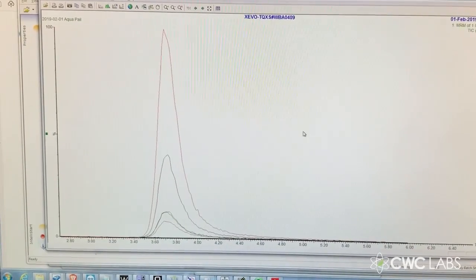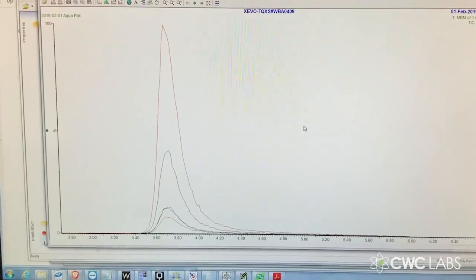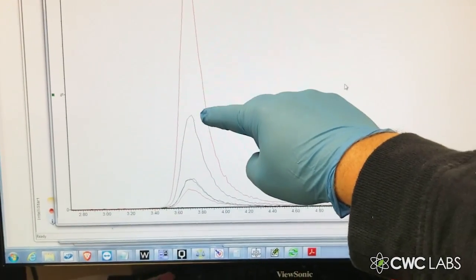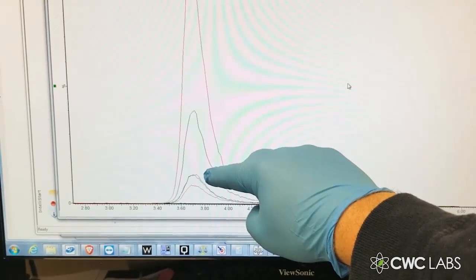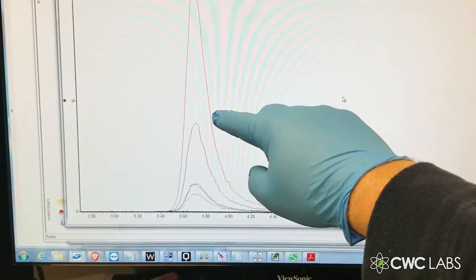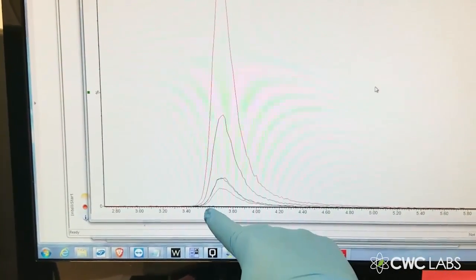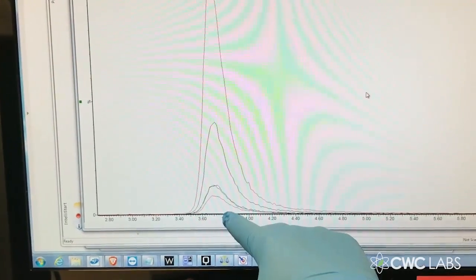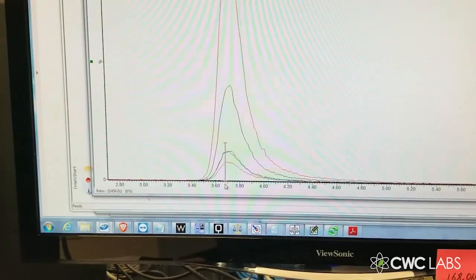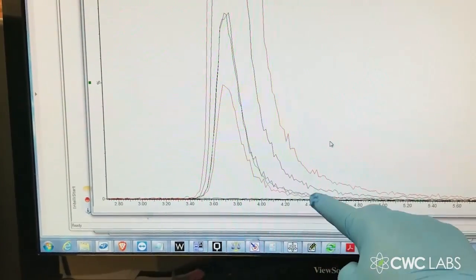Finally, here are the results for the large filters. And by the way, I'm going to walk you through all these shortly to show you exactly which filters did what. But this is the original 2 ppm glyphosate. And then these are the results of the large filters, the gravity filters, showing that even the worst one performed not bad. It's kind of mid-range, but several of them performed very well. And there are 2 down here that performed extraordinarily well. You can't even really see them unless I zoom in. See, there's a zoom in, and you see there a couple of lines right down there, baseline.